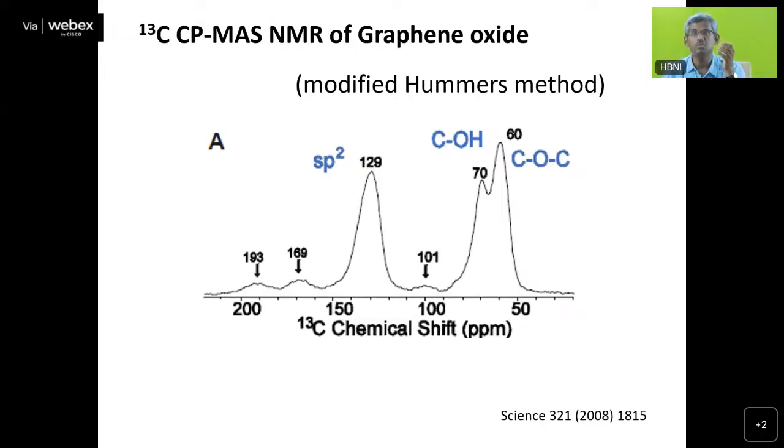We also discussed correlation spectra, like the heteronuclear or homonuclear correlation spectra you record in solutions. We can also have a correlation spectrum using two carbon-13.